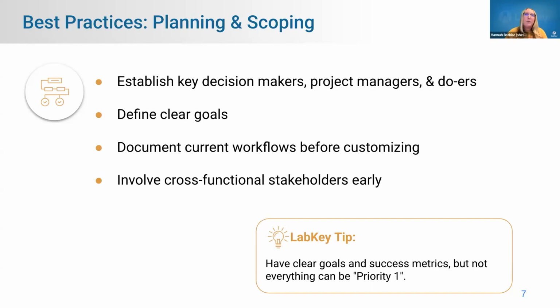is accurate, for example. And then the last one here is really making sure that you're involving those cross-functional stakeholders early, which I mentioned already, making sure that everybody is aligned with what the LIMS should do and be is going to be super important in that initial stage of the implementation.